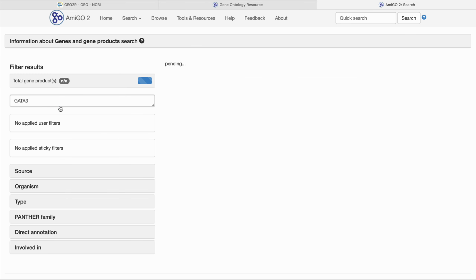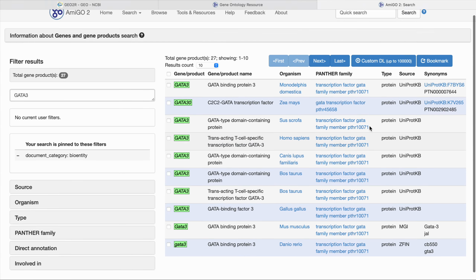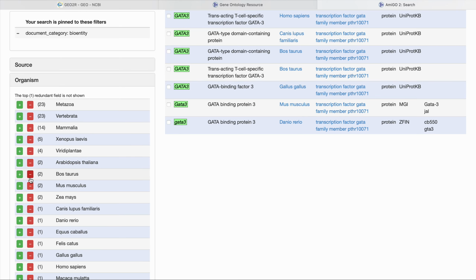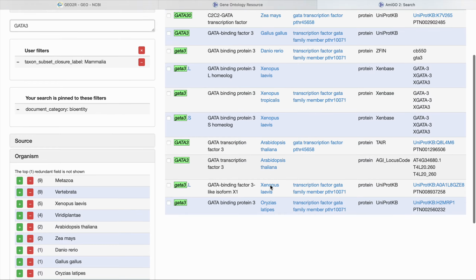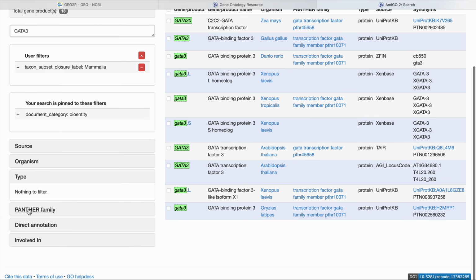We can also go by the gene and gene product, because what it codes for, or what it influences, is also very important. Of course it codes for a protein, and that particular protein might be of our use. So you can go by the source of it, then the organism name. If you want to filter out certain things, like if you don't want to include mammalians, you can do a minus, so the mammalian results would be gone from here. Here you can see only Gallus and others are there. So likewise you can apply the filters.